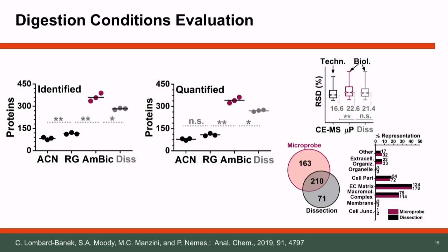And so what we found is that, compared to whole cell dissection, we have first the same reproducibility, and then we have pretty much equivalent coverage in terms of proteome, if not better, than cell dissection. And that alone shows that there is not that much heterogeneity, at least in those cells. In the one cell, yes, we see heterogeneity, but not in those smaller cells.